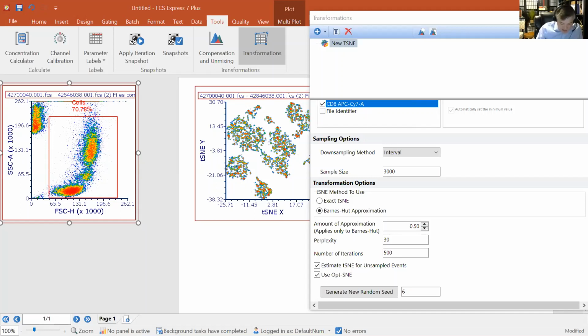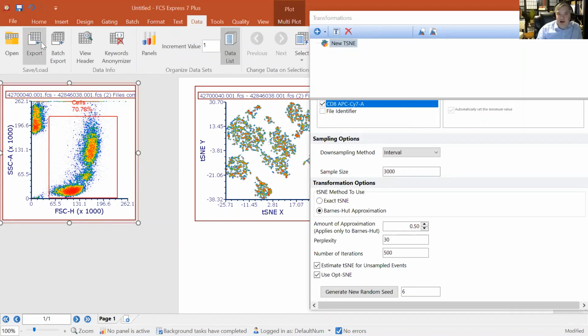Yeah, so MQD files would need to be merged a little bit differently. In the interest of time for this talk today, I'd say, please contact me directly. Write me at sean.burke@DeNovoSoftware.com, or reach out to our support team at support@DeNovoSoftware.com. There's other ways of merging this data. The merge FCS file option will only work for FCS files, but there are tools in our data tab here for loading up and then batch merging data sets like MQD.